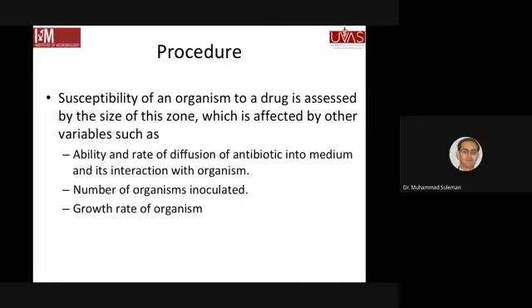If your antibiotic is crystallized, if your antibiotic is having a property of not being diffusible or water soluble or having very poor solubility, तो वो आपकी एंटीबायोटिक जो है वो मीडियम में डिफ्यूज़ नहीं करेगी, and it will be unable to interact with the organism to inhibit it. तो बहुत ज़रूरी है कि आपकी जो एंटीबायोटिक है उसको पॉसिबिलिटी हो डिफ्यूज़ करने की.